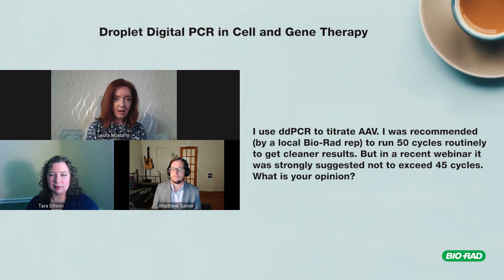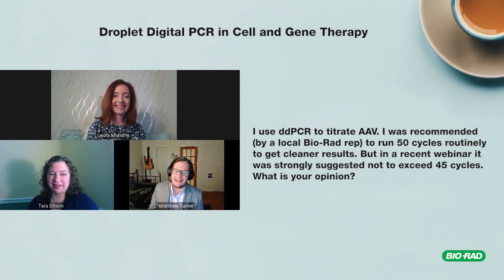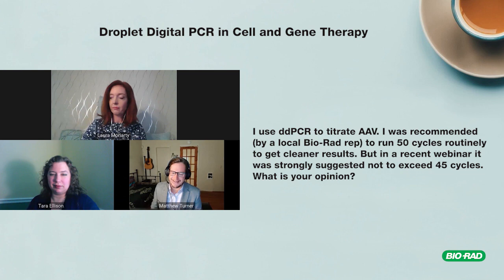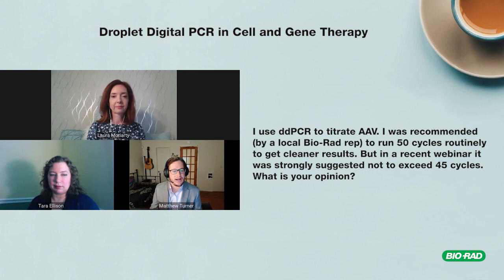A user titrates AAV with ddPCR and was recommended to run 50 cycles, but a recent webinar strongly suggested not exceeding 45 cycles. Running 50 cycles is not recommended because at that point you might start amplifying things that are not your target of interest. Our typical recommendation is to run up to 40 cycles across the board. If you're not getting the target, try running concentration gradients or redesign the assay.